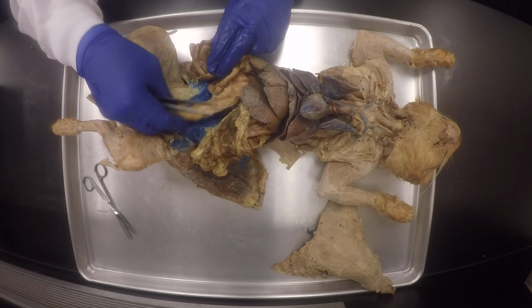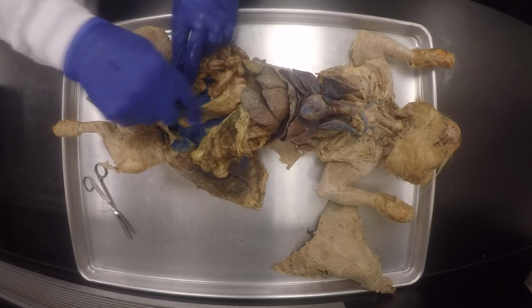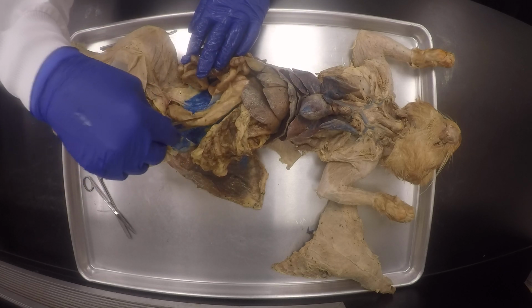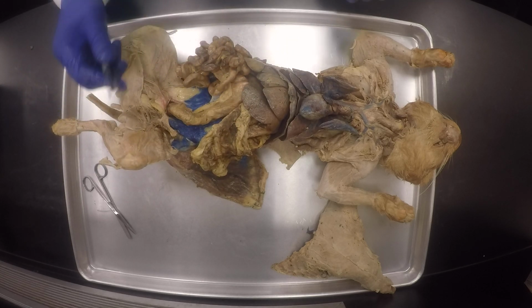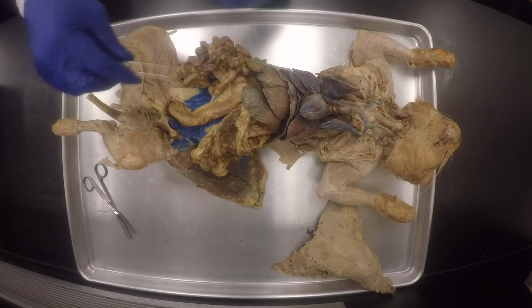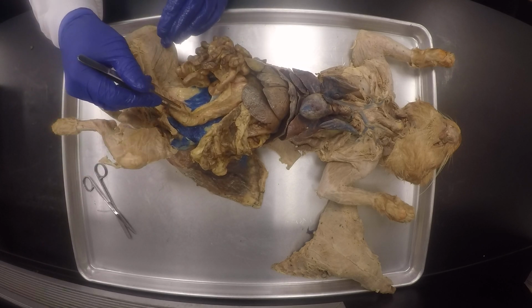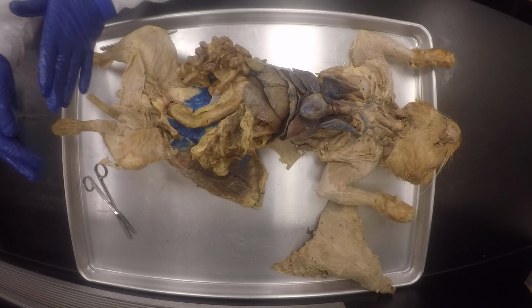This one was about to defecate because there was a lot of material in there, and then they killed it. I mean, they didn't wait for it to go. Anyway, this is the descending colon. Did you see the other one, cat? It's flat. It is all empty. I'm just saying because yours is like that. We just don't have time to go pick it up and show you. But yeah, so this will be the rectum. So the rectum collects all the feces. There's no sigmoid colon, as you can see. It's just the descending colon, then the rectum, the anal canal outside.